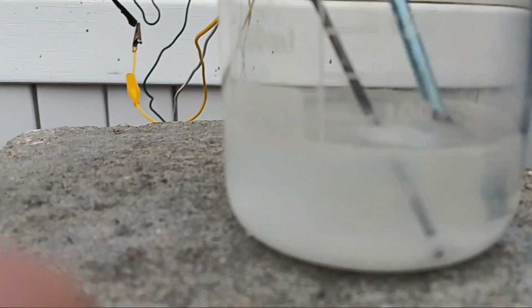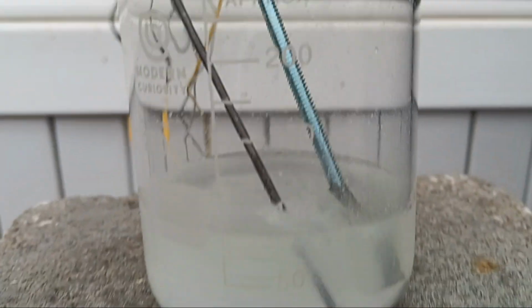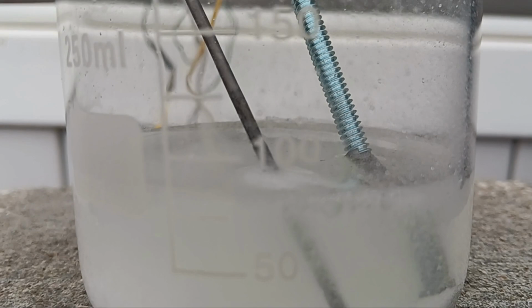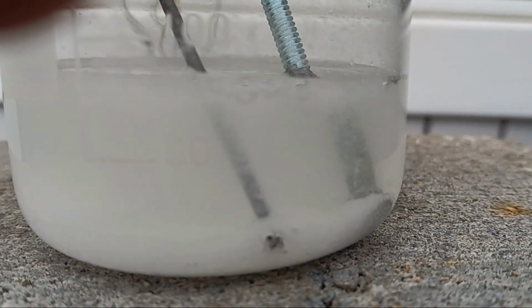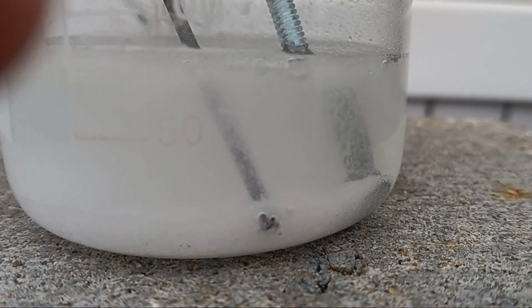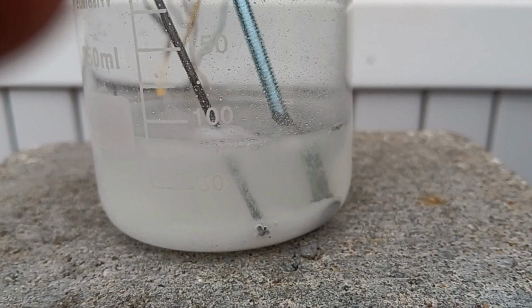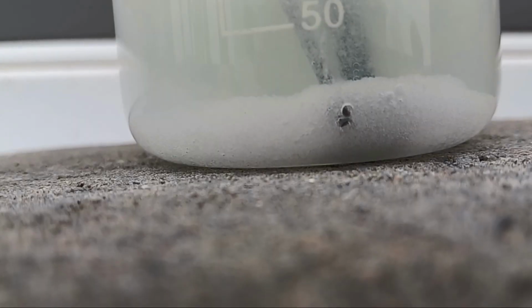This results in more chlorine being produced, but also a greater amount of rust forming. As I said previously, this metal is coated in something, which is usually another metal oxide, such as zinc or nickel even. This helps the metal not rust. However, I do not think this affected the end result very much, as the end result, as you will see, is a very red powder.